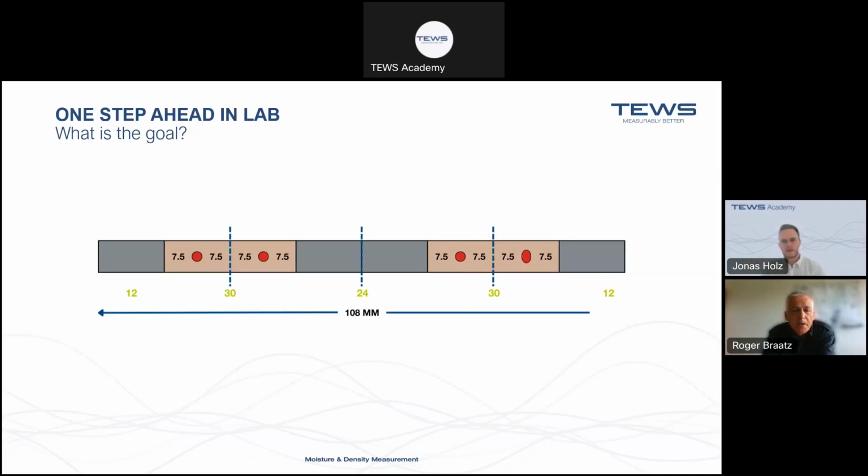Here we see the spec of the same kind of filter which we saw as a result in the last page. So the customer usually has a specification for the length of each piece of this combination rod. Those are the segments, right? Yeah.